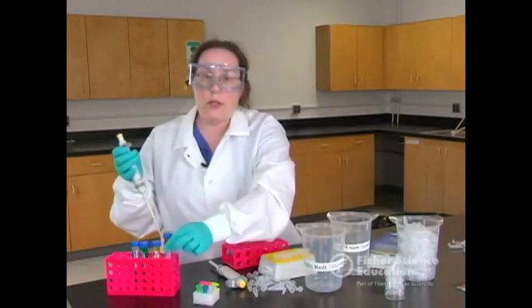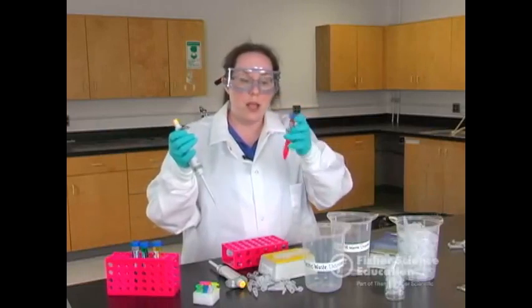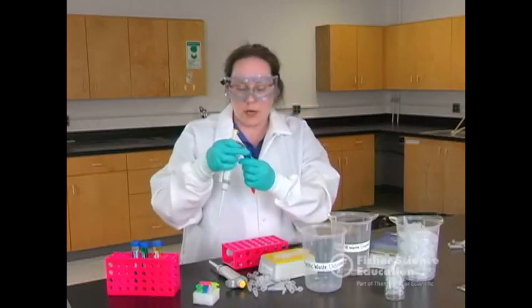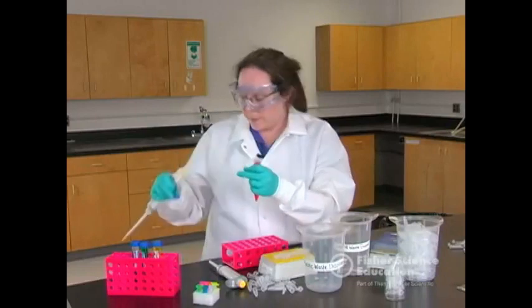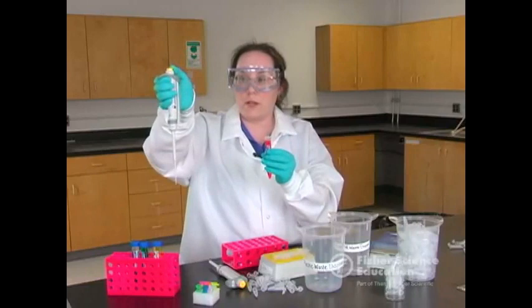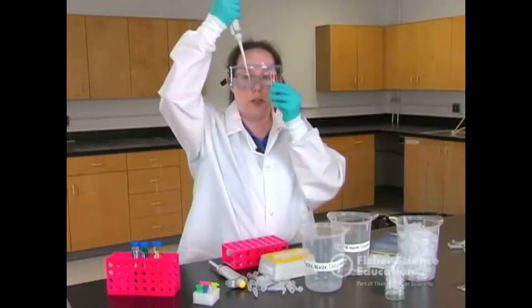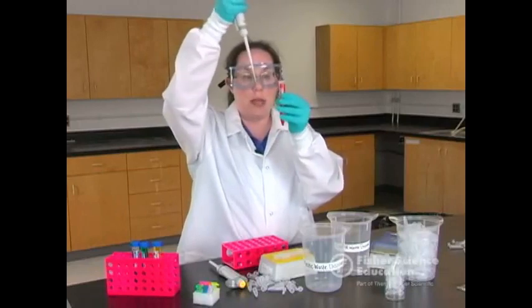And I just teach my students with food coloring. So I label my tubes to say practice dye, and food coloring is a very inexpensive way to get some color into your lab. I'm going to go ahead and go to my first stop again. This is always going to be at eye level, so you want to train your students right here. This is the pipetting zone.